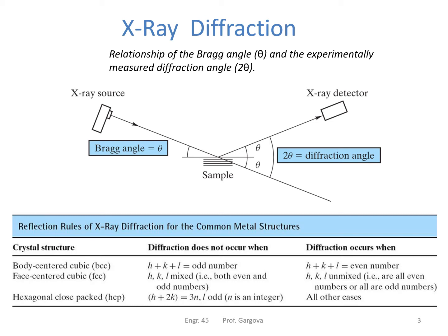Now, for certain crystal structures, they have different arrangements of atoms.